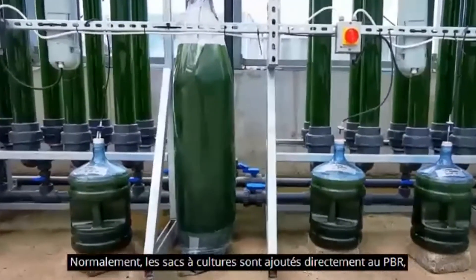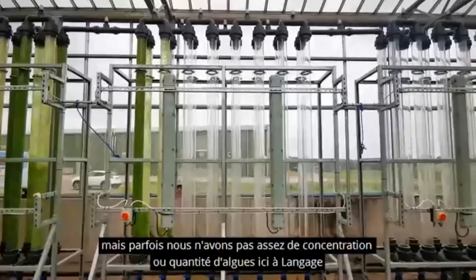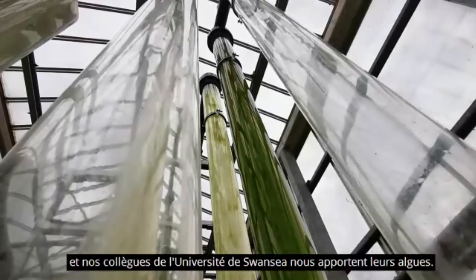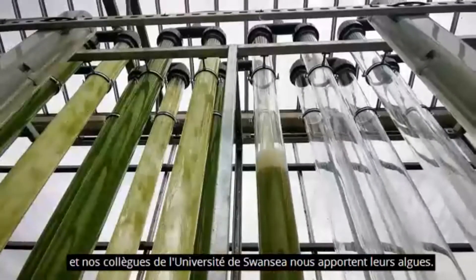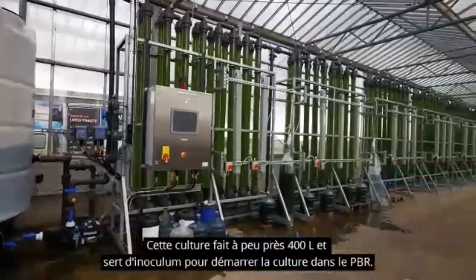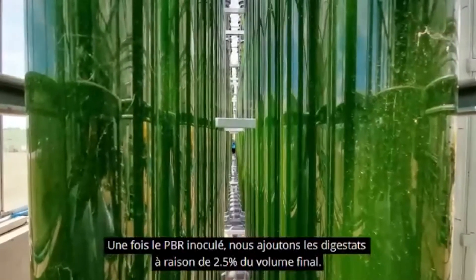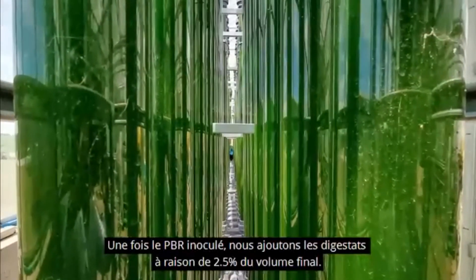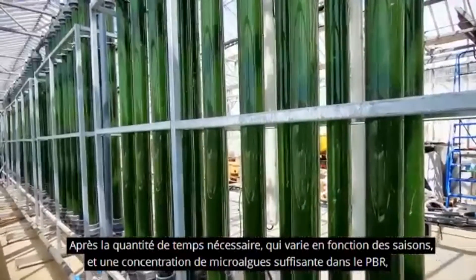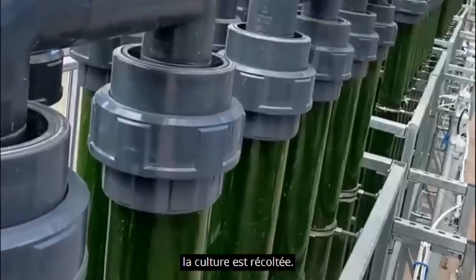Normally for the inoculation, the culture bags seen above are added directly to the PBR. However, sometimes we don't have enough concentration or amount of microalgae here in Langage, so our colleagues in Swansea bring us the culture directly from the university. This culture is about 400 liters, which serves as an inoculum to start the culture in the PBR. Once the PBR is inoculated completely or partially, we add the digestate to 2.5% of the final volume. After the necessary days — which may vary depending on the season — and with enough microalgal concentration within the PBR, the culture is harvested.